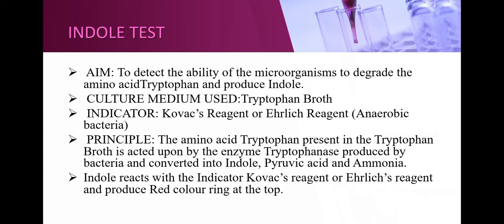Principle. The amino acid tryptophan present in the tryptophan broth is acted upon by the enzyme tryptophanase produced by bacteria and converted into indole, pyruvic acid and ammonia.